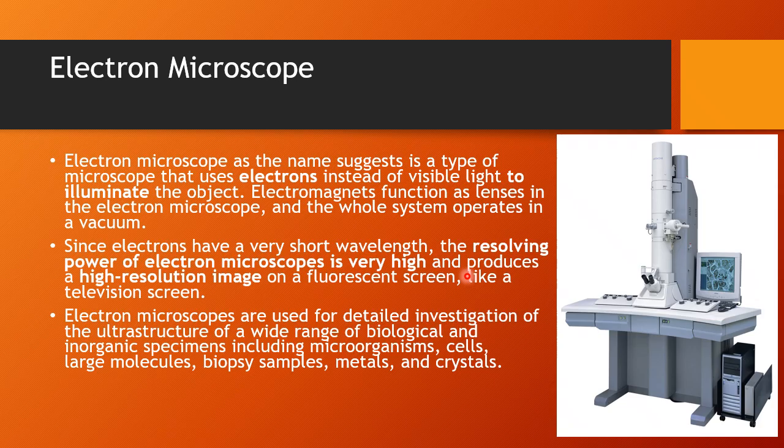Apart from that, electron microscopes are quite costly. Because of their high cost, we don't use them in normal laboratories, or for teaching institutions and teaching purposes. They are only found in specialized research institutions, universities, and advanced industrial labs where they require high resolution imaging of nanoscale structures.